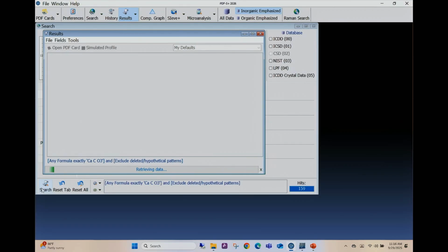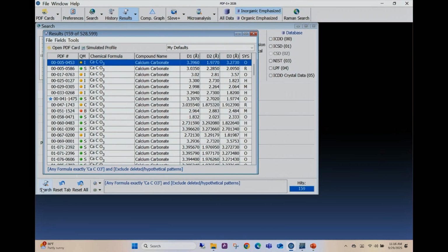We heard a bit earlier today that one of the things around calcium carbonate is that there are three polymorphic forms. You can have calcite, aragonite, and brookite. Oh, I'm sorry, that's TiO2. And you can look and see here that I do have different crystal systems, consistent with the polymorphism.